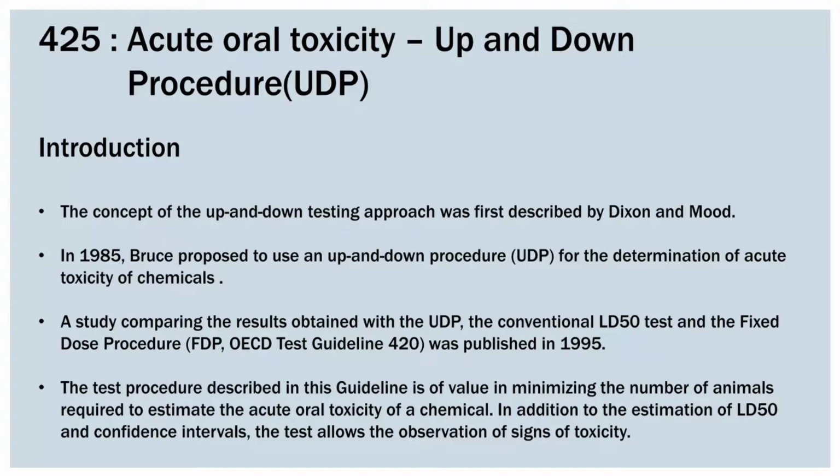Sometimes it needs 2 or 3 for the determination of LD50. The exact dose of LD50 we can determine by this method only. In this method, we can observe a specific interval between two doses, and we can also see the signs of toxicity while giving the doses.